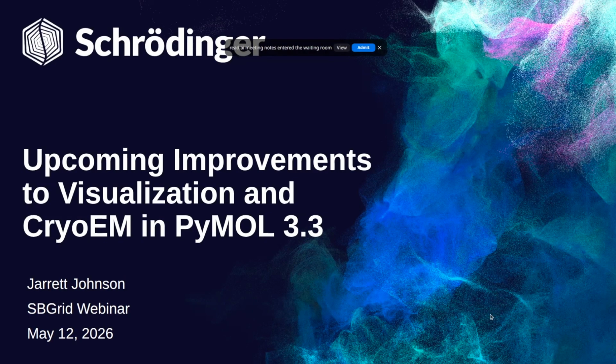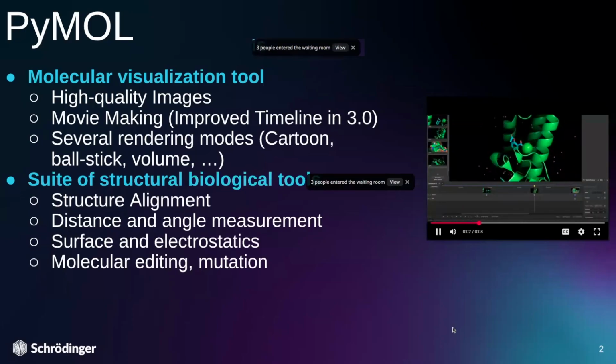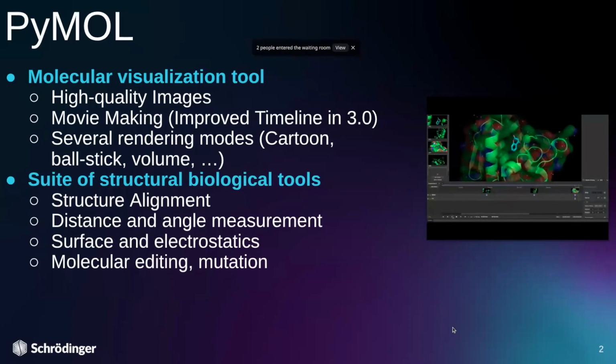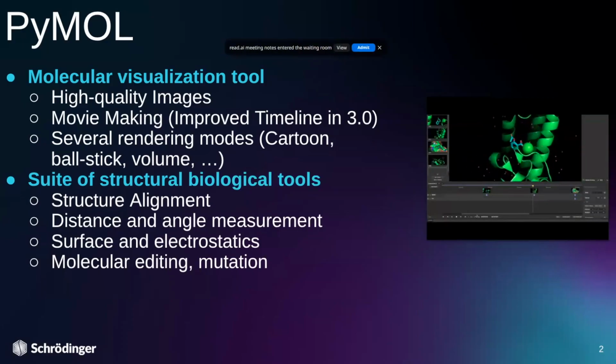Today I'm going to go over some visualization and CryoEM updates that are coming in PyMOL 3.3. As mentioned before, I don't want to say PyMOL needs no introduction, but it is a common tool that is definitely used throughout this community.